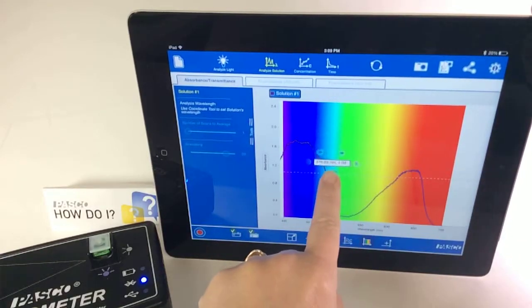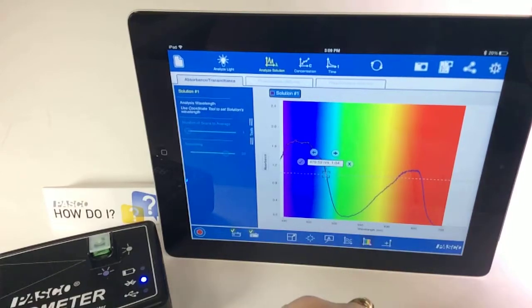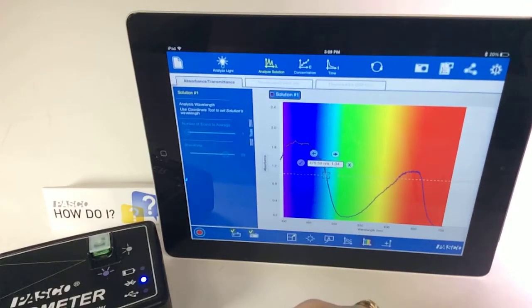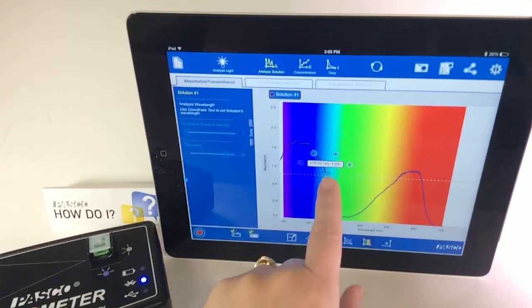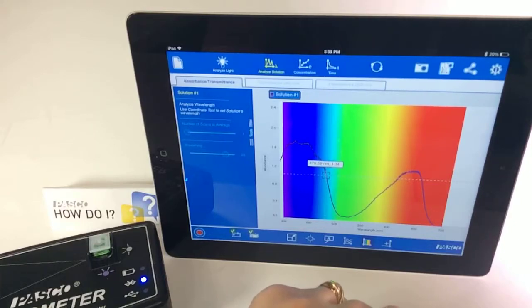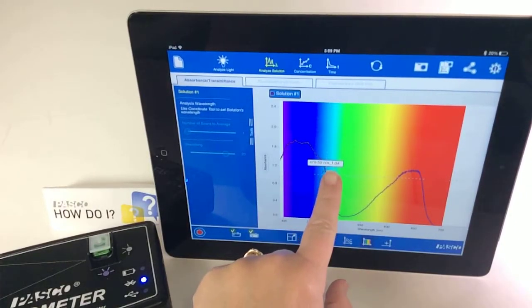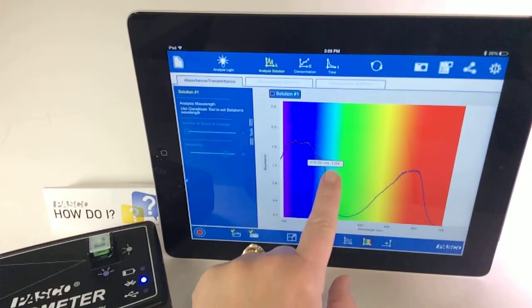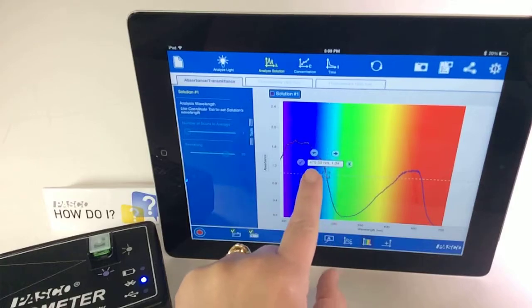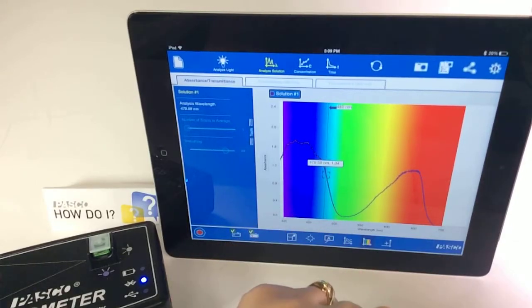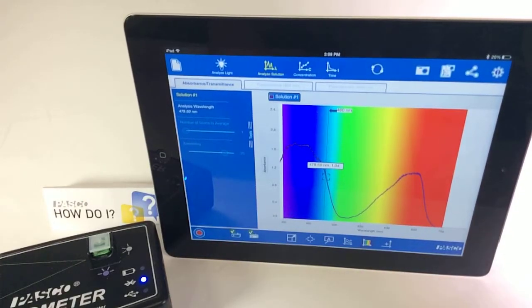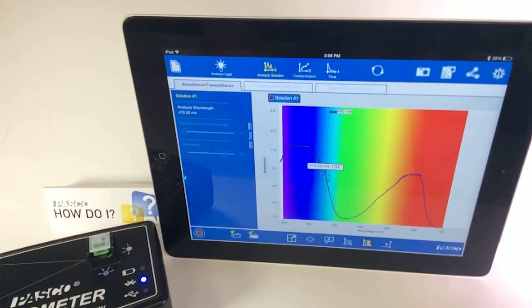I can choose any part of the curve. And then once I've selected the wavelength that I want to use for the analysis, I can tap in the middle of the coordinates box and then select the check mark, and that will define the wavelength for the procedure.